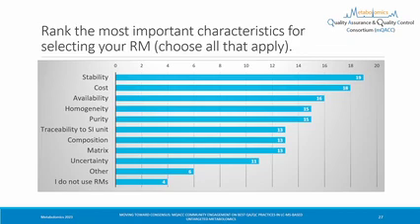We're looking for a material that's the same over long periods of time, years, SRM 1950s at decades now. Also, cost and availability is important because we want a large community to be able to access these tools so that we can enable data harmonization. And then purity, traceability, and uncertainty are very important in quantitative analyses.